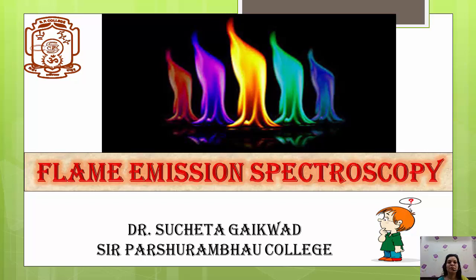Today, we are going to learn about one of the techniques, flame emission spectroscopy. By looking at this first slide, at the colors of the flame, a question might come to your mind: how does the color of the flame change? So we are going to learn in detail about flame emission spectroscopy, its principle, working, components, applications, advantages and disadvantages.